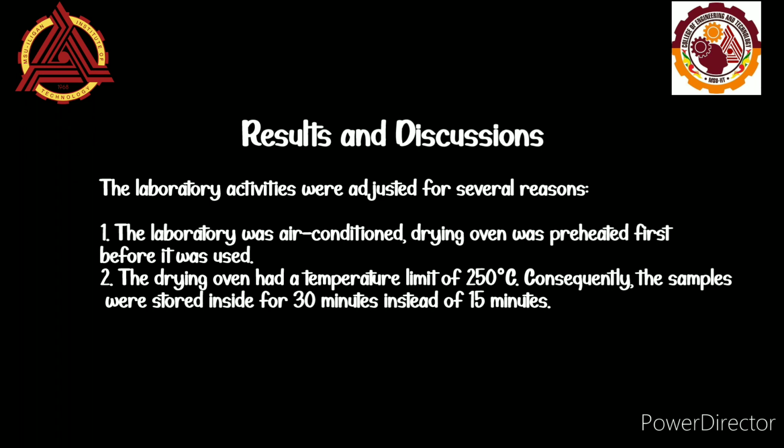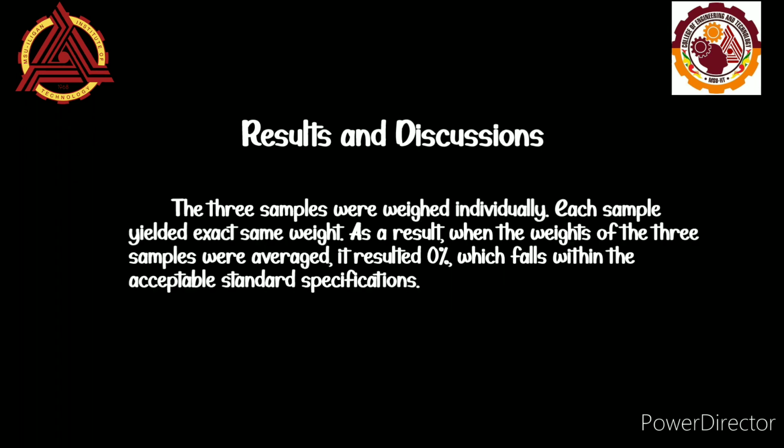After ignition, the 3 samples were individually weighed using the balance and weights. Surprisingly, each sample yielded the exact same weight. As a result, when the weights of the 3 samples were averaged, it resulted in a value of 0%, which falls well within the acceptable standard specifications. The maximum allowable weight loss for the sample was set at 3% maximum.